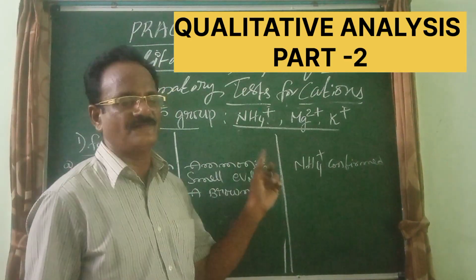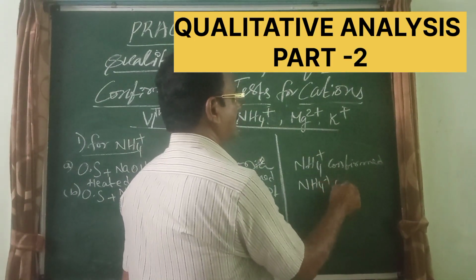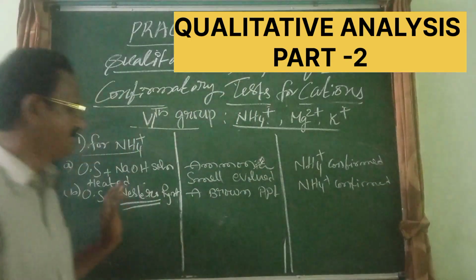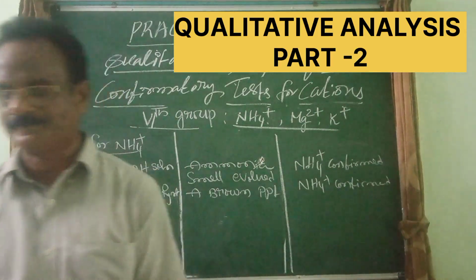So the first test is to be considered the confirmation test. If the original solution is added with Nessler's reagent and a brown precipitate is formed, NH4+ is confirmed.